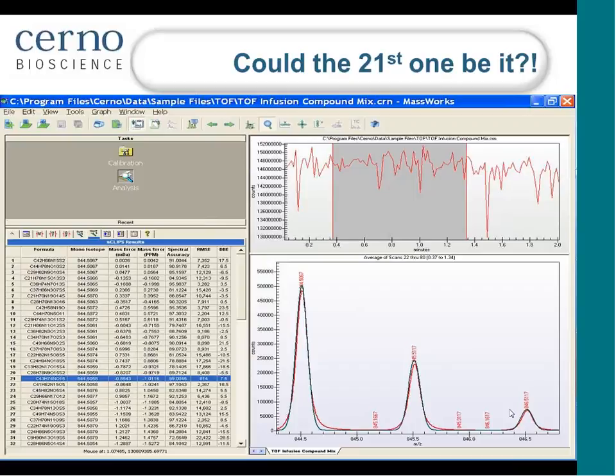It could also be that this particular mass spectrometer has a particular peak shape due to the ion optics and other factors that impact the mass spectral peak shapes, such as detector systems, the reflectrons, and the acceleration fields, and so on and so forth. So it could also be a combination of those two. So it's a little difficult to tell what may be going on here and how we would evaluate these particular formula candidates.